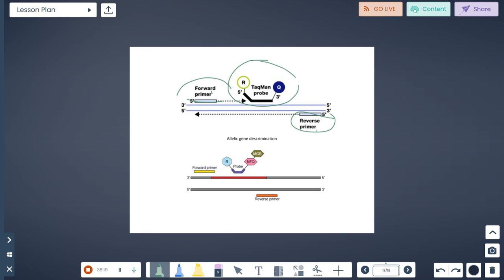So when the PCR is extending, because of the 5' to 3' exonuclease activity of the enzyme, it will remove the fluorescent part and it will be released into the solution, and the fluorescence will accumulate. When the cycle goes up, more TaqMan probe will be degraded and released from the quencher, so the fluorescence will accumulate. That is why this is a modified PCR product. But this will not extend any reaction because the 3' end is blocked by a quencher.